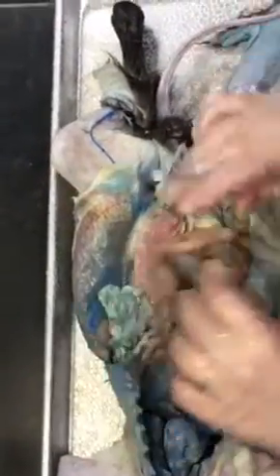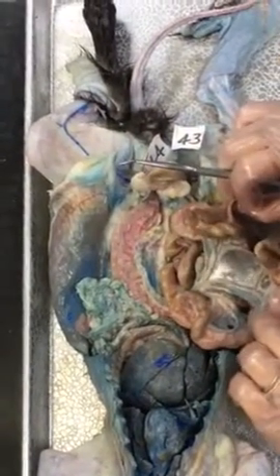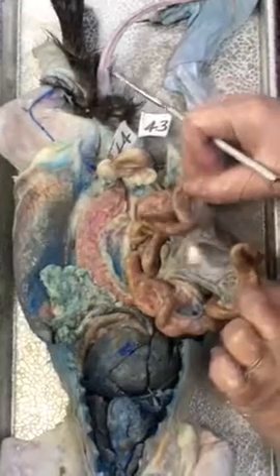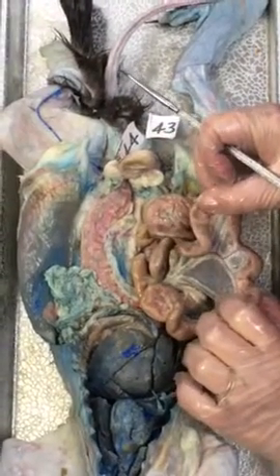Now as far as the mesentery, we left the mesentery off. The mesentery is this stuff that holds the small intestines in its place. You see how it snaps back? And it also provides a pathway for the arteries, veins, and lymphatic vessels.